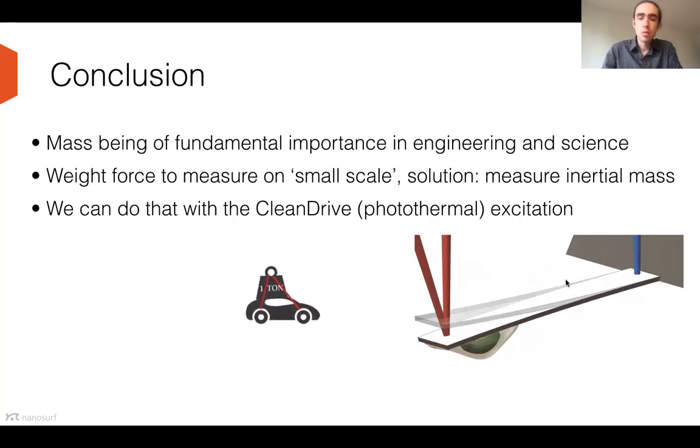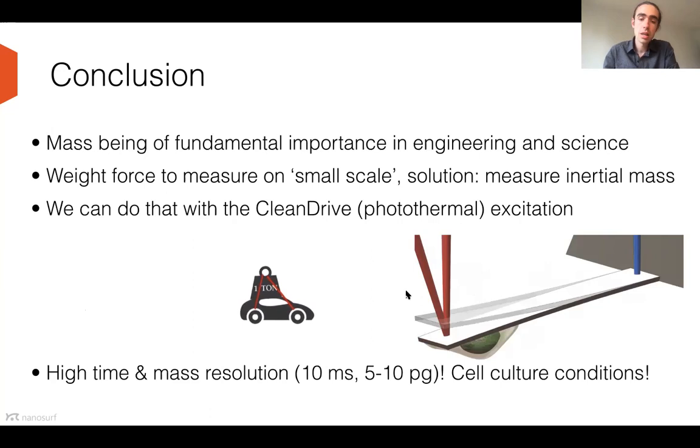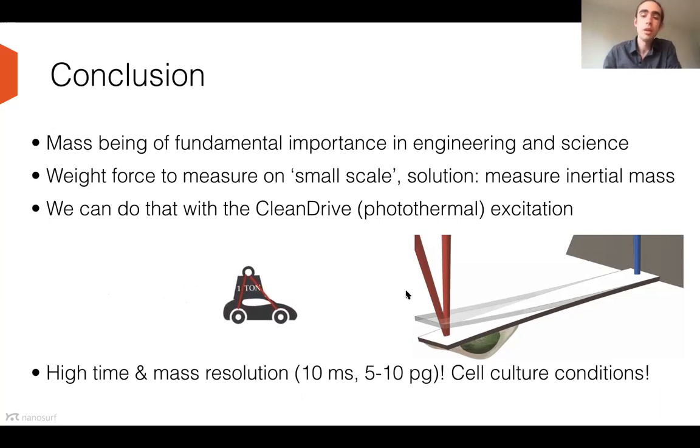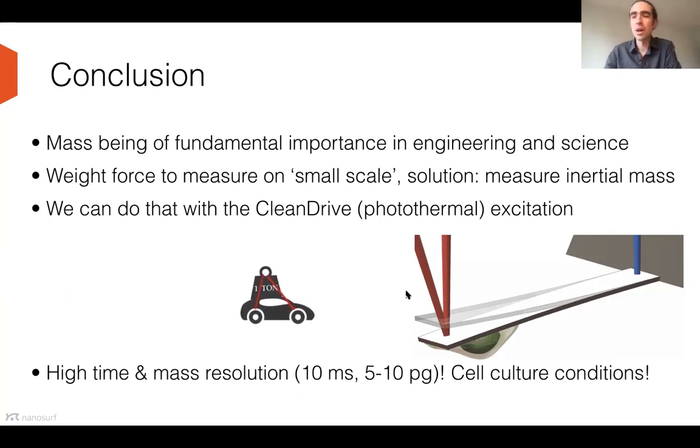What I further told you is that there is a very high time and mass resolution that we can achieve with that instrument. That is 10 milliseconds and just 5 to 10 picograms, even lower for yeast cells if you take smaller cantilevers. And everything that we have seen and done has been done in cell culture conditions, so there is no effect on the health of the cells, unless you want them to be unhealthy, for instance if you infect them with a virus or stress them in any other way, to see how this affects their mass behavior.